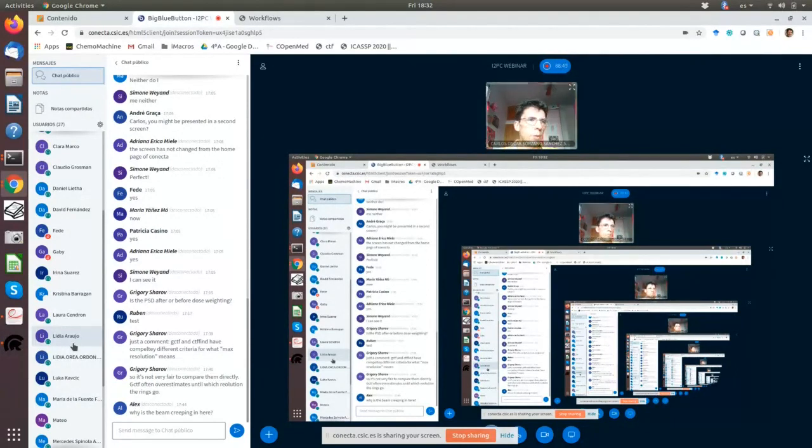It's up to you. I prefer doing the 2D analysis on tight boxes, so I concentrate on what is seen just around the particle and just a bit around it. And then for the 3D analysis, when you have to deconvolve for the PSF, you need the information around. So definitely there you need the extra space.